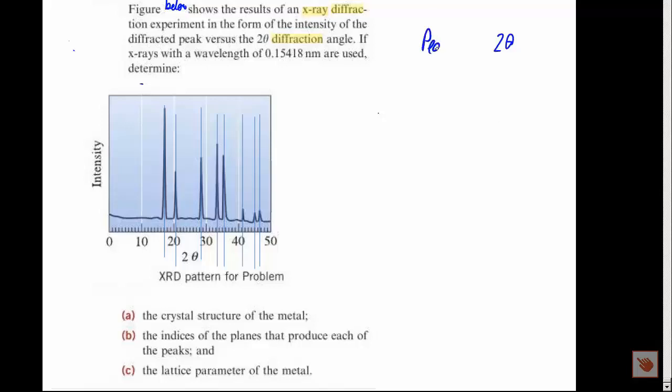So, okay, there's 1, 2, 3, 4, 5, 6, 7, 8 peaks.